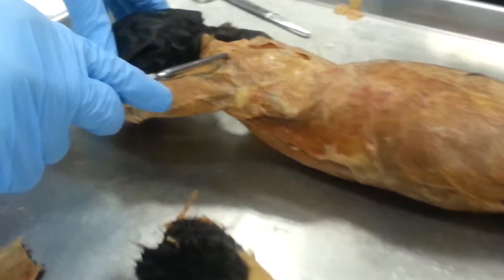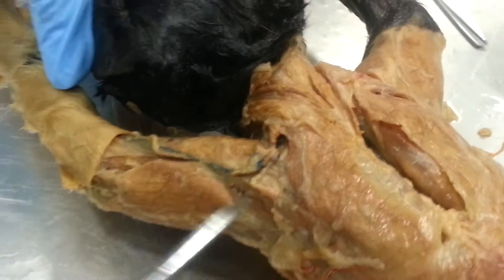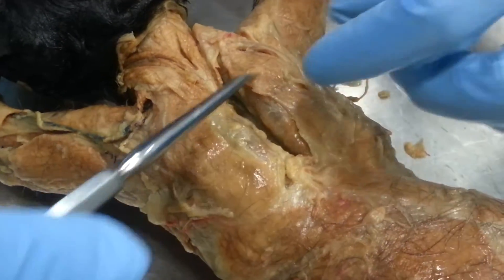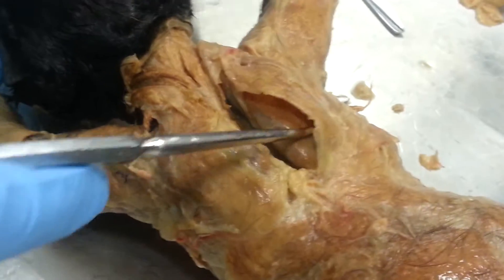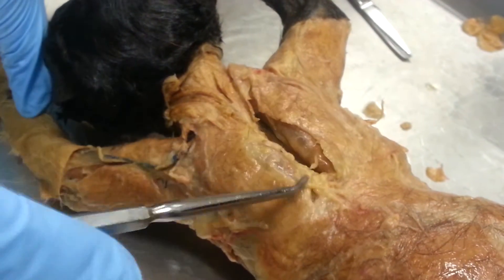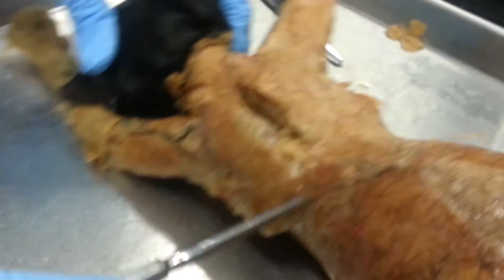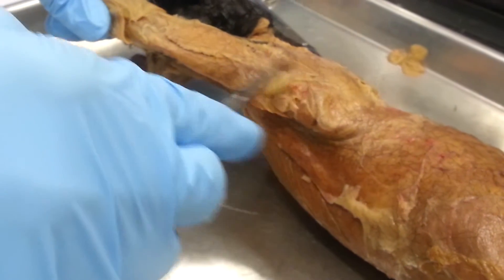So this is the clavotrapezius right here. And then this mass is the acromiotrapezius. My pronunciation is wrong, I know that — no, it's okay, we all struggle. So let's see, this is the spinodeltoid.